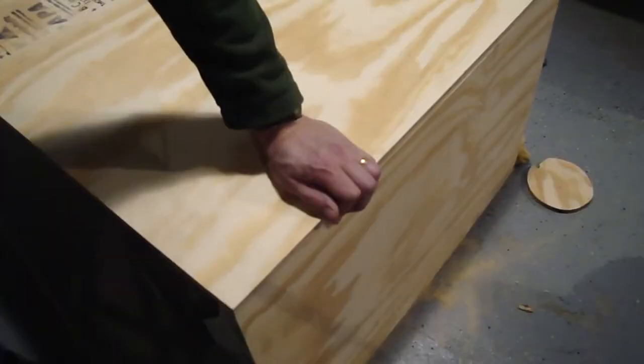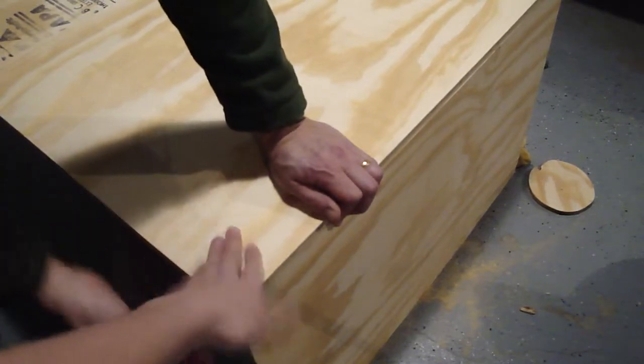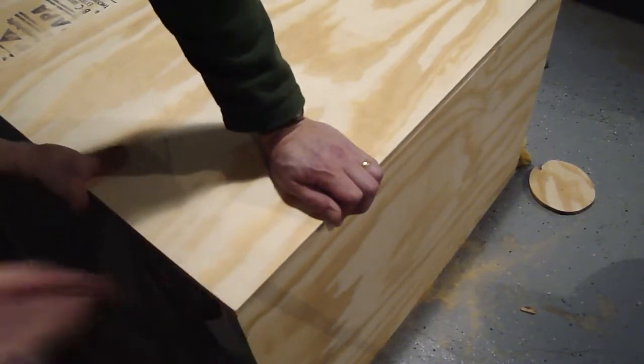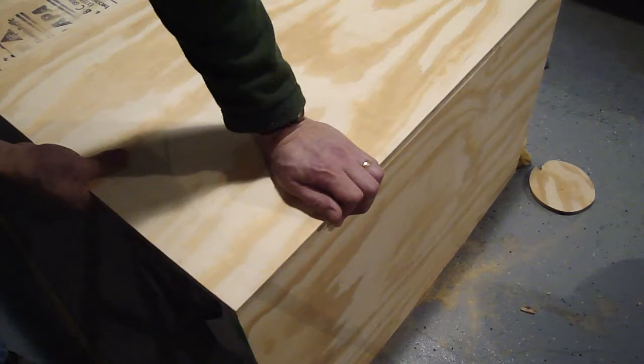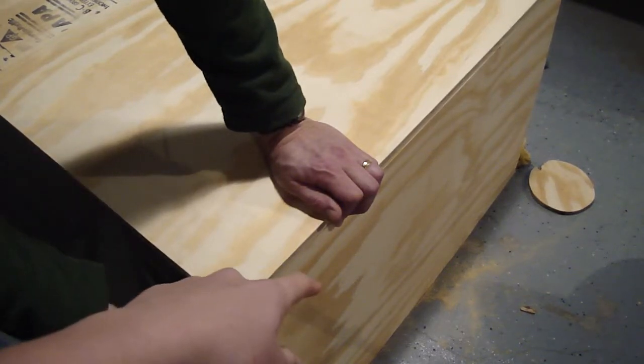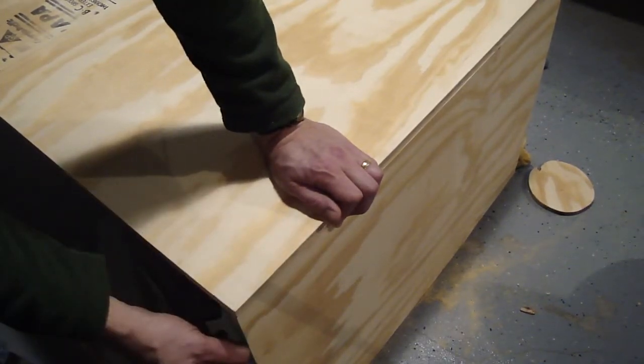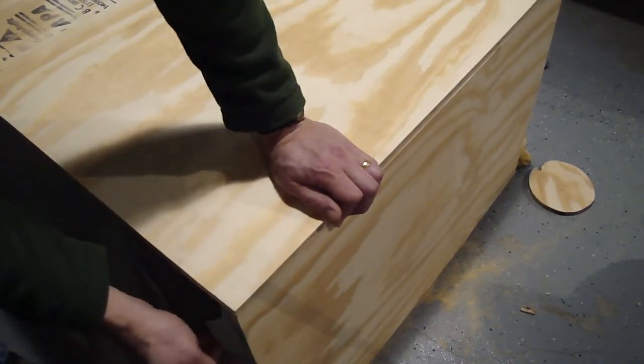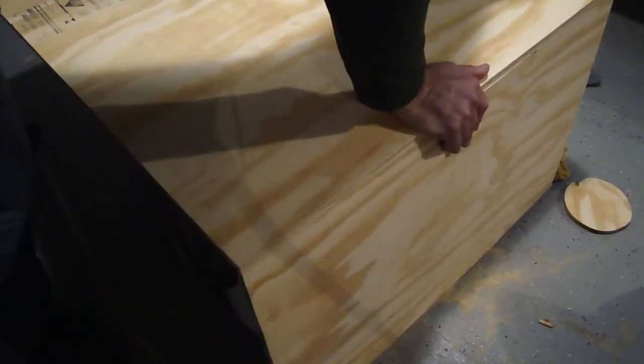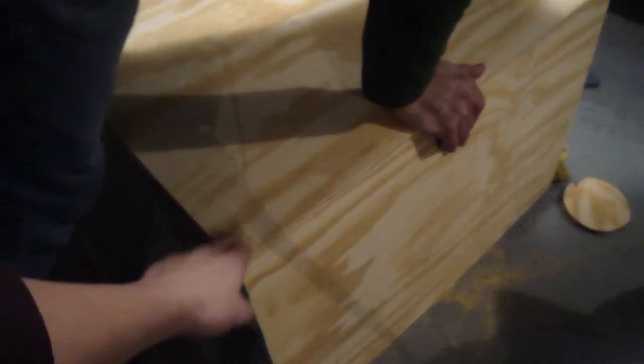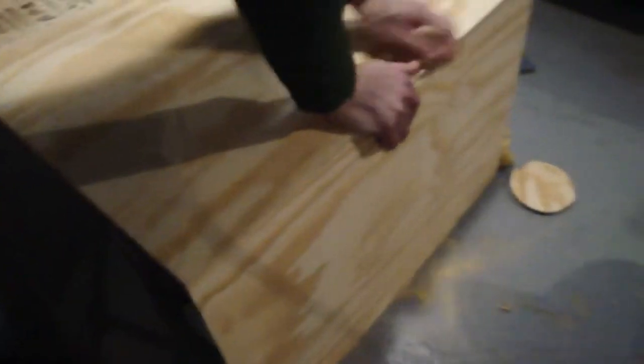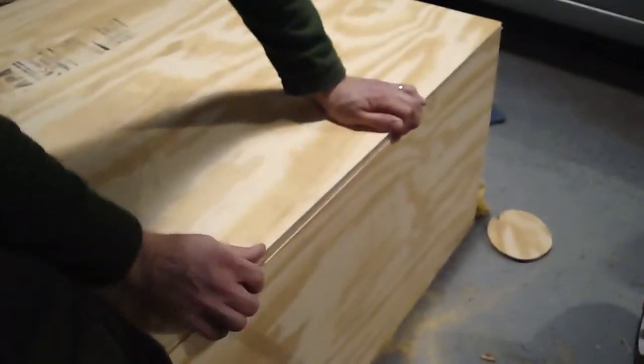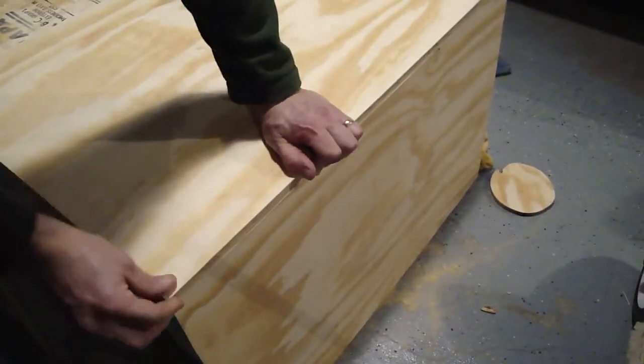First we're going to attach the back, which is this 28 inch by 40 inch piece, to this 28 inch by 20 inch side piece. We're going to do one screw at the bottom, one screw in the middle, and one screw up at the top so that it'll be secure all the way down.